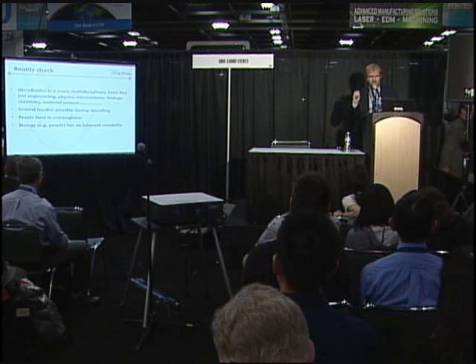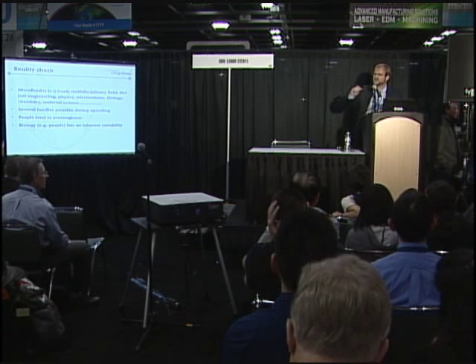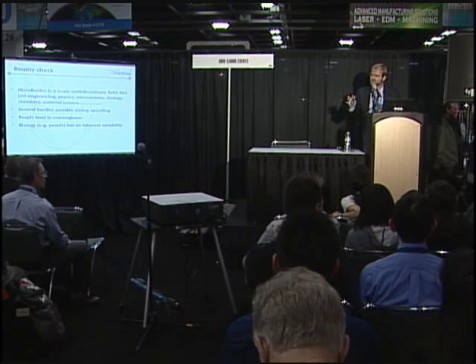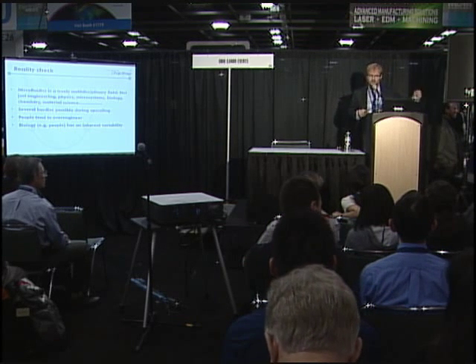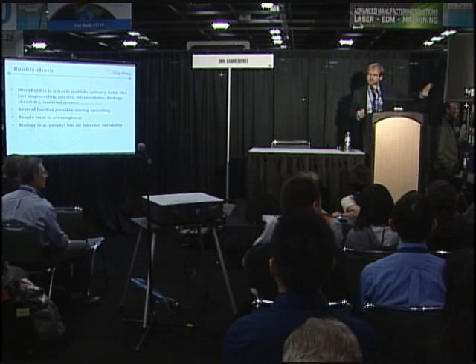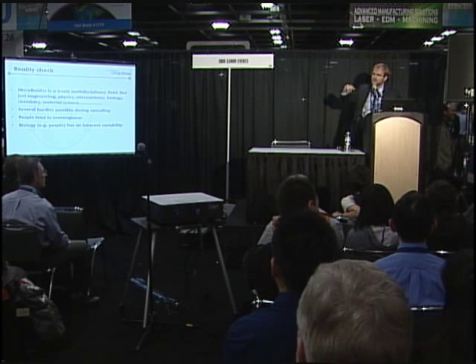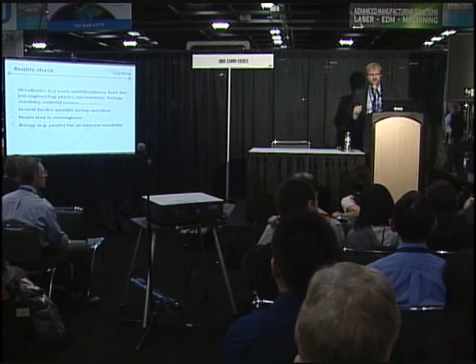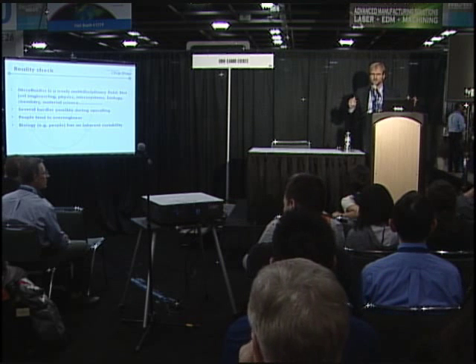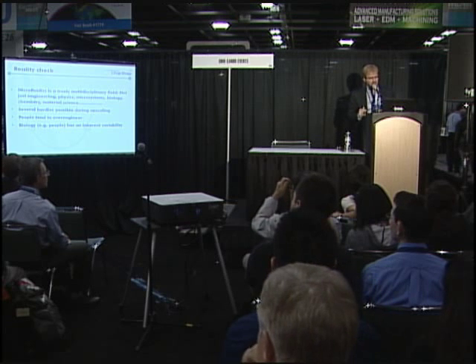A Microfluidic device which has been designed to withstand, let's say, with passive valves which withstand a certain internal burst pressure in material A, made with method A, and with a certain given surface roughness, will not work exactly the same if you do it with a different material, with a different manufacturing method. So eventually that valve simply might leak. So that's very important to keep in mind.